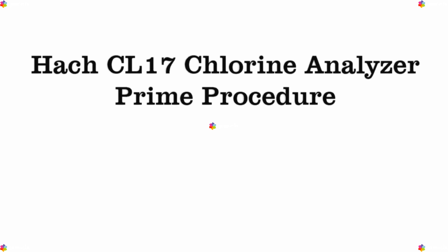This video will guide you through the steps for the prime procedure for the Hach CL17 Chlorine Analyzer. Let's get started.